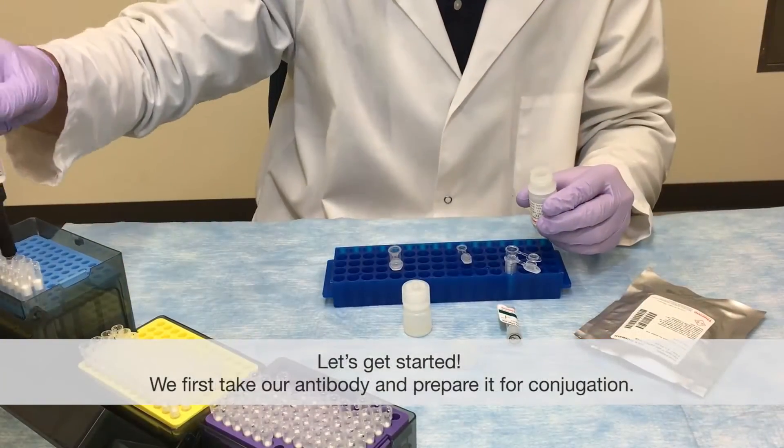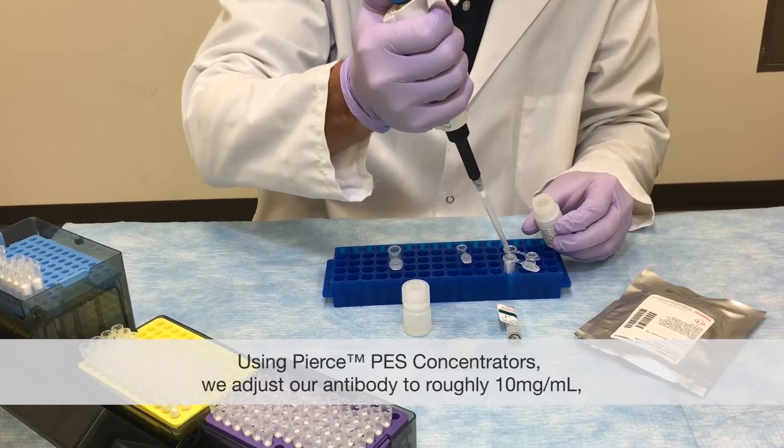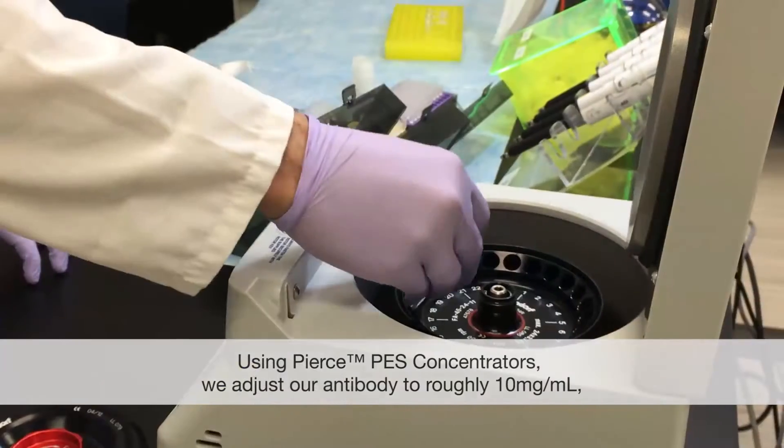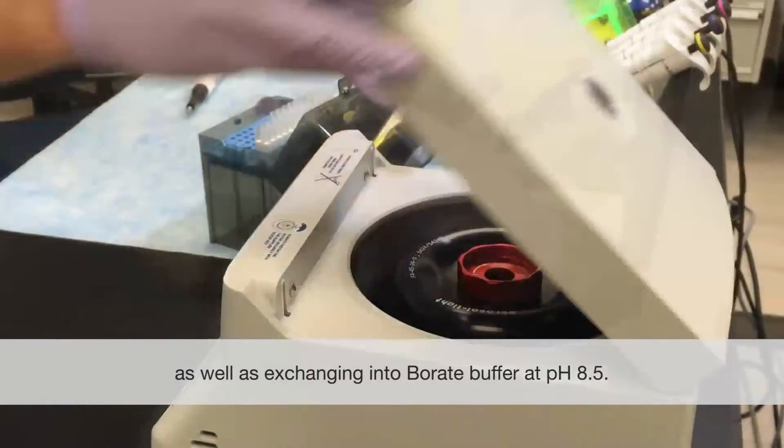So I'm here with you today to share this simple but powerful method to dual label an antibody. Let's get started. We first take our antibody and prepare for conjugation. Using Pierce PES concentrators, we adjust our antibody to roughly 10 mg per ml and exchange into borate buffer at pH 8.5.